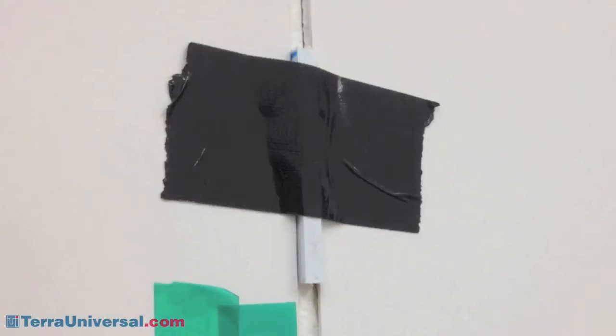Finally, use plastic spacers that leave gaps between panels in floor, ceiling, vents, or outlets. These gaps will be filled with a urethane seam sealant.